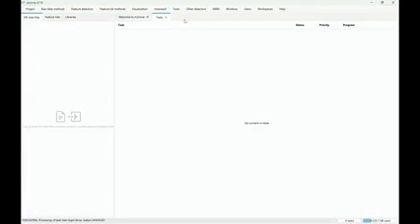Okay. Usually, hands-on goes kind of slow, but once we get the data processing done, you can play around. So if anyone has some issues with the user file, please just point up, and there's a couple of people helping you. Just point to them, and maybe they can also distribute a little bit in the room.